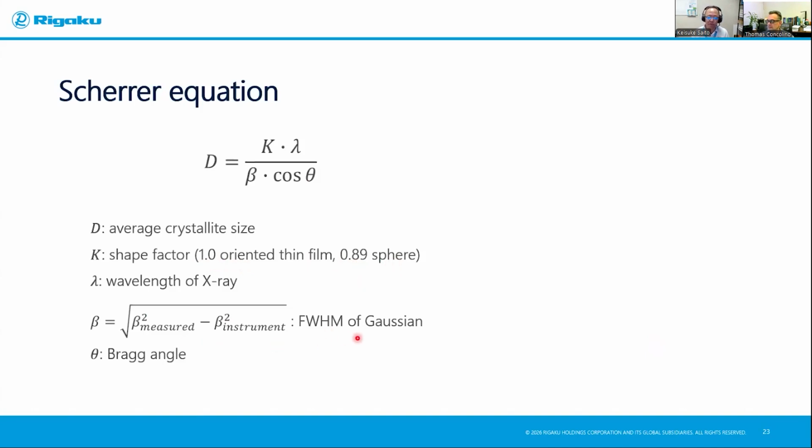So most of the diffraction pattern looks like a Gaussian. In this case, the peak broadening should be calculated by this formula. And this is your measured peak width, which needs to have the instrument broadening subtracted, right? So how do we know the instrument broadening? You simply measure some standard, for example, the NIST provided standard reference powder materials like lanthanum hexaboride, or silicon powder. That's perfectly fine.